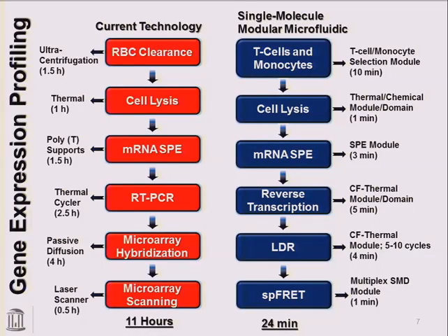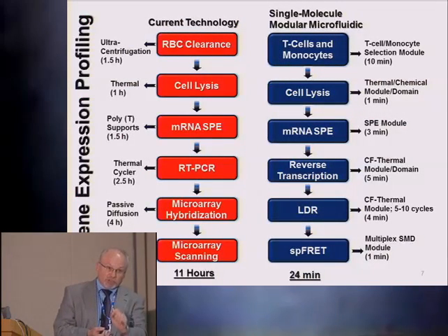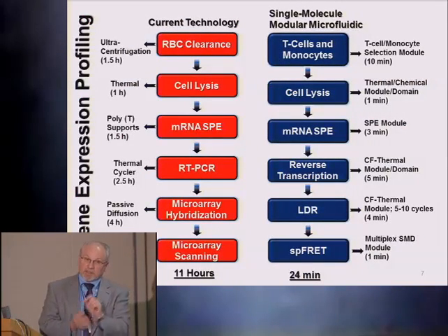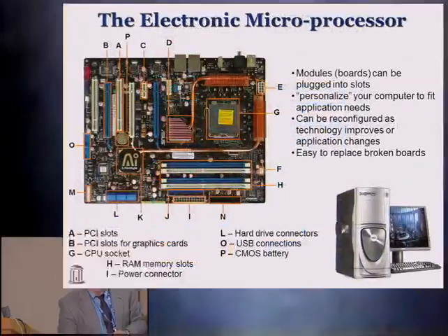Everyone who does optical spectroscopy knows that photon counting is much better in terms of quantification than analog measurements. Jim Weidenford wrote a series of papers on that about 10, 15, 20 years ago. So we're doing digital counting. We're actually counting the copies of the material that we're generating to get this quantitative data, and I'll show you some results of using that strategy.